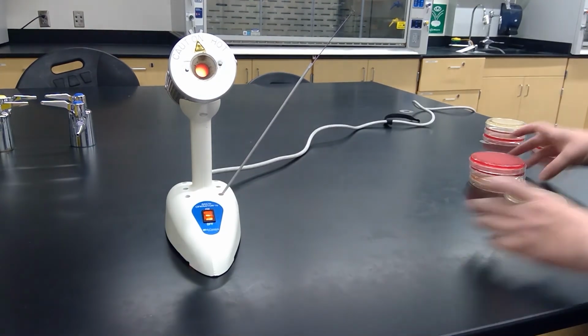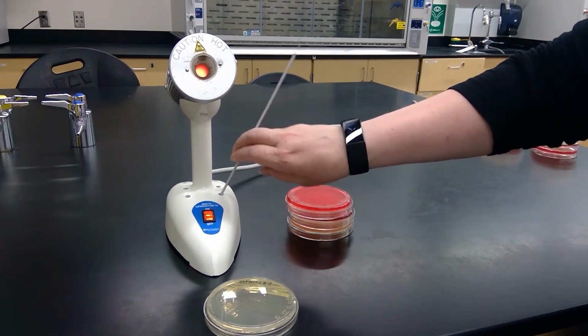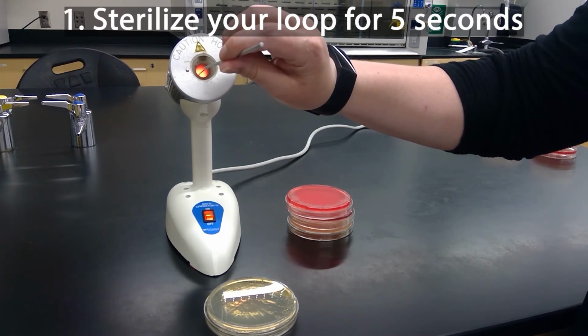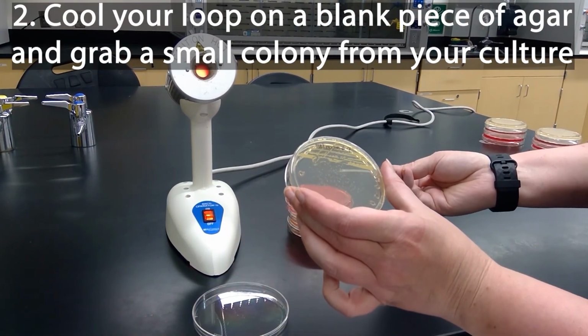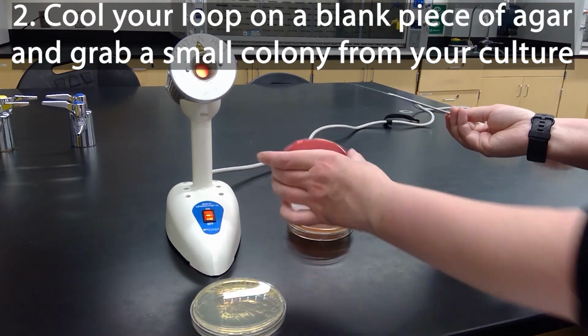And now we'll move on to unknown number 9. So we'll sterilize our loop again. Then we'll grab some culture and stick it onto our plate.